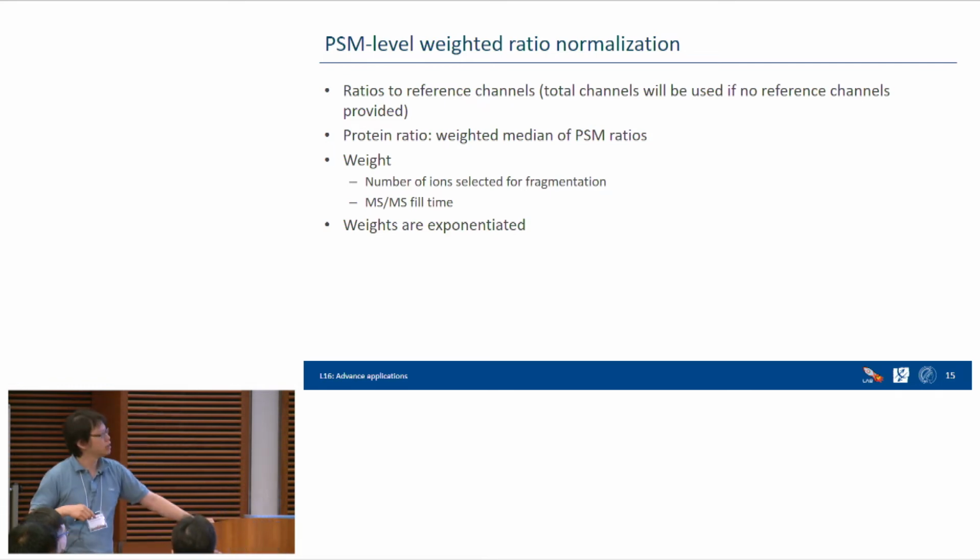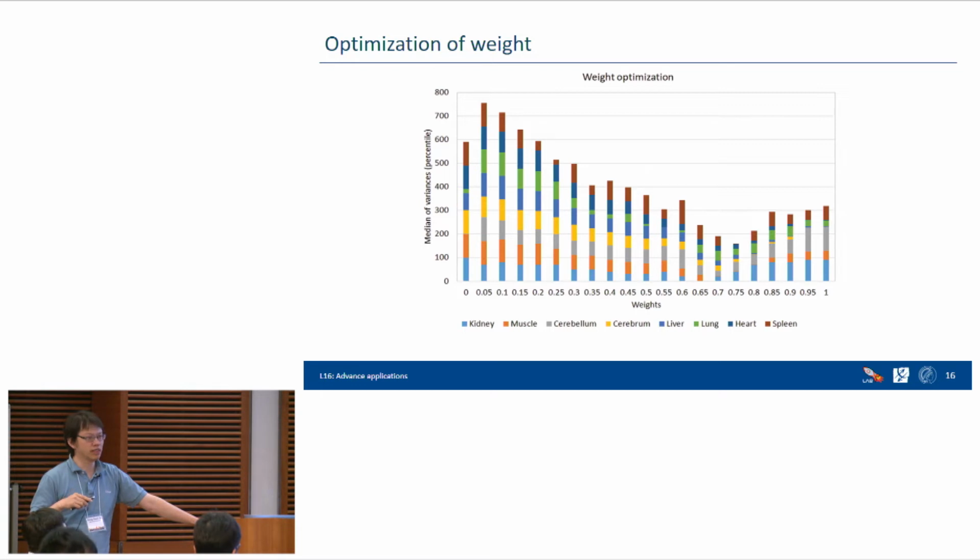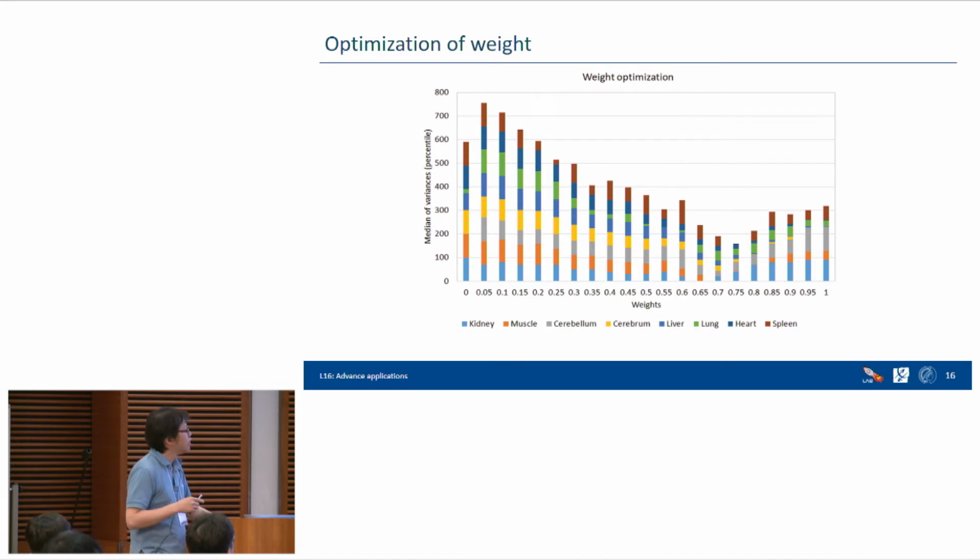We applied this method to the 2 datasets, and you can see that with the match run, compared to without, we can improve quantification by 30%. This is extremely useful for single-cell data. We can increase quantification by 70% to 100% there, but even for this small sample we can still increase it by 30%.